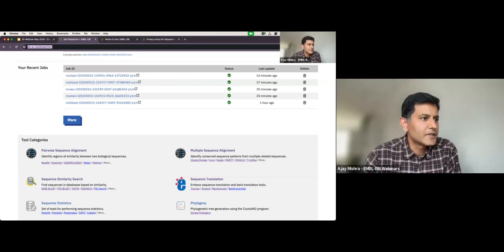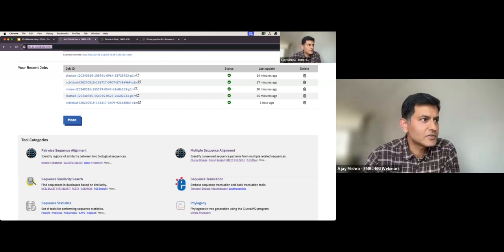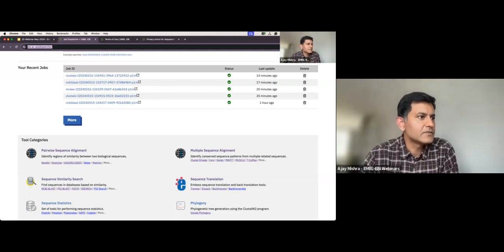Thanks, Anya. So the question that we had about the cluster has been expanded now. Orthofinder could be used to produce single copy gene clusters that have only one physical location in the genome. Single copy genes can have orthologs in different species and are used as markers in various studies, which include phylogenetic comparisons and species classification. I want to know if there's any tool that could do the same.